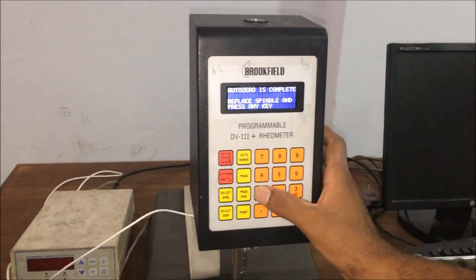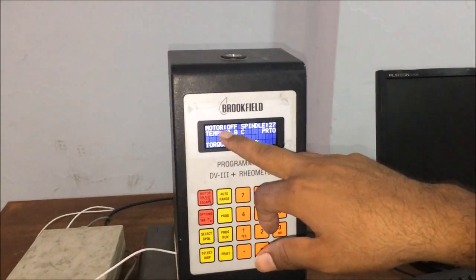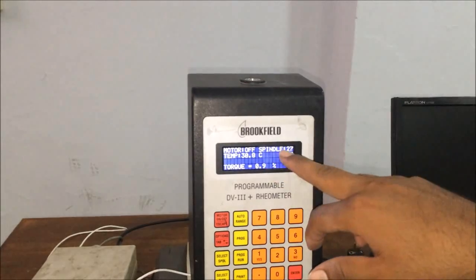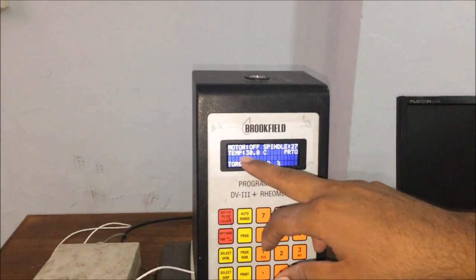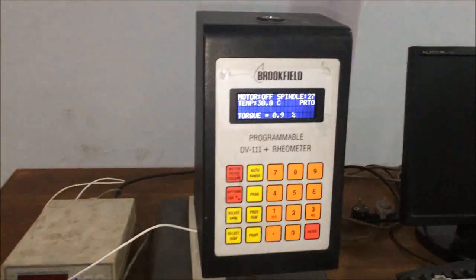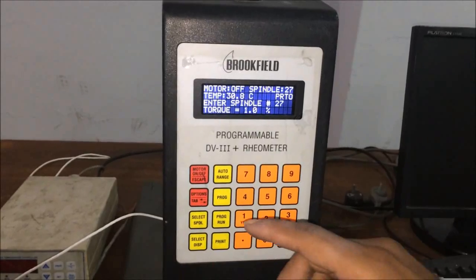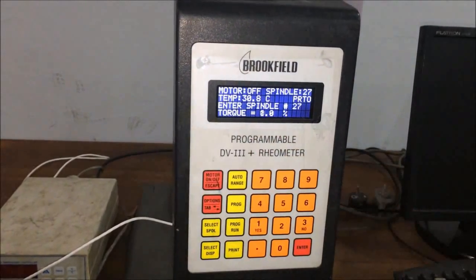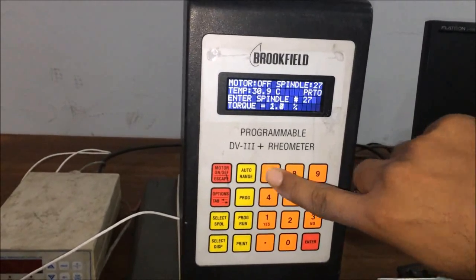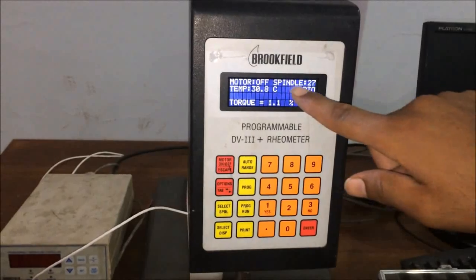The screen says press any key. We will press it. You can see the motor on/off screen displaying whether the motor is off or on, and the spindle number, temperature, and torque readings are shown here. First, we have to select the spindle using this button. The screen shows 'enter spindle number.' Since we are using spindle LV27, we will press 27 and then press enter. Our spindle is now set to 27.